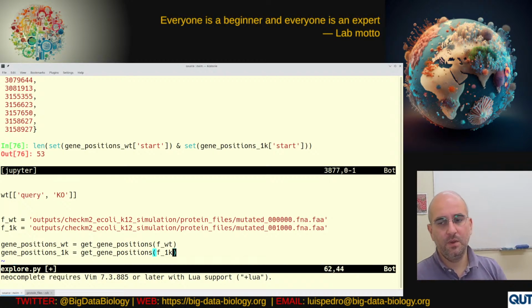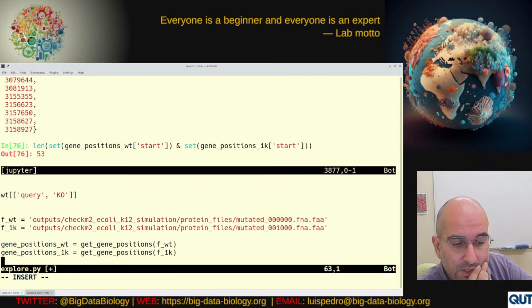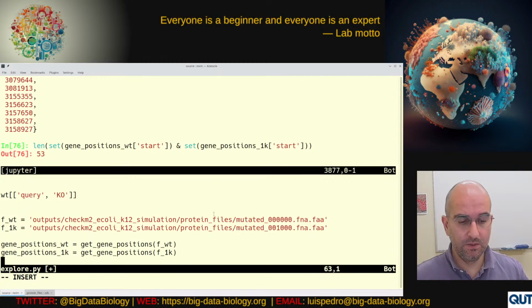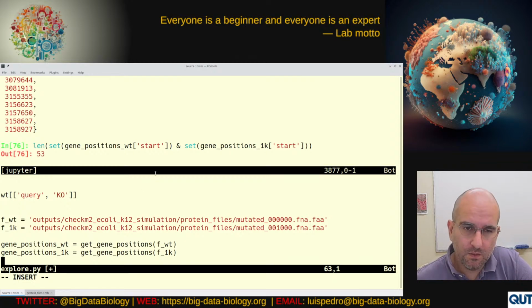Okay, this is annoying. So we're gonna have to look at the actual sequences, right? If we look at the actual sequences, we're still looking for instances where the original is not. Let me just check whether the original is not. Okay, so we could load all of the actual sequences and look.